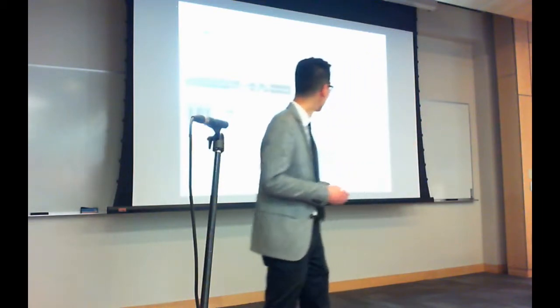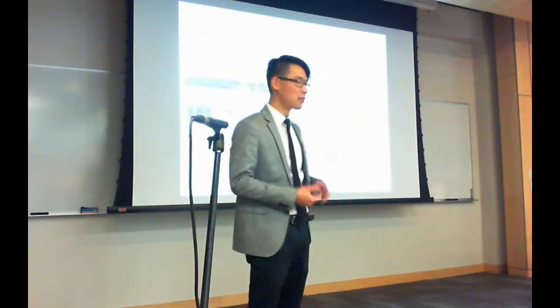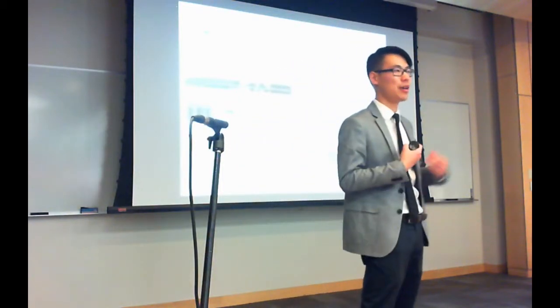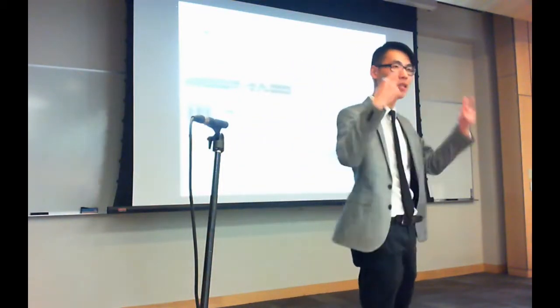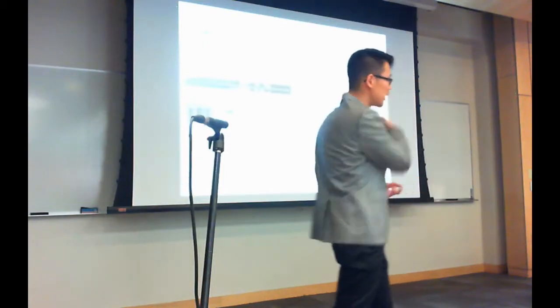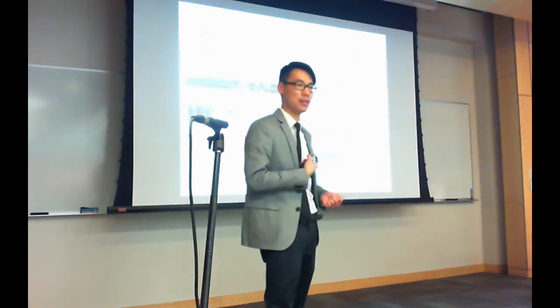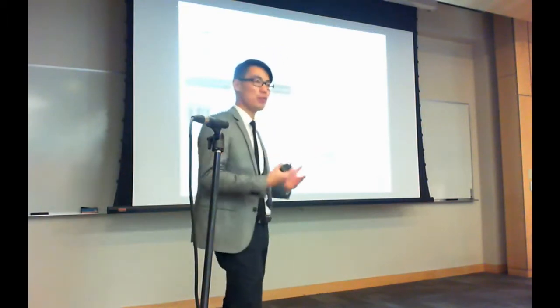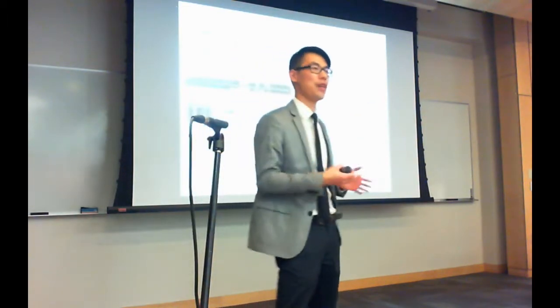And so just to give a quick overview of everything we talked about today. We started off asking, okay, given a spectral library, a reference spectrum, and something unknown, how do we say that these two are the same compound? So we assessed spectral matching significance. After that, we talked about how natural product libraries are small and don't identify very much. How can we expand beyond that?